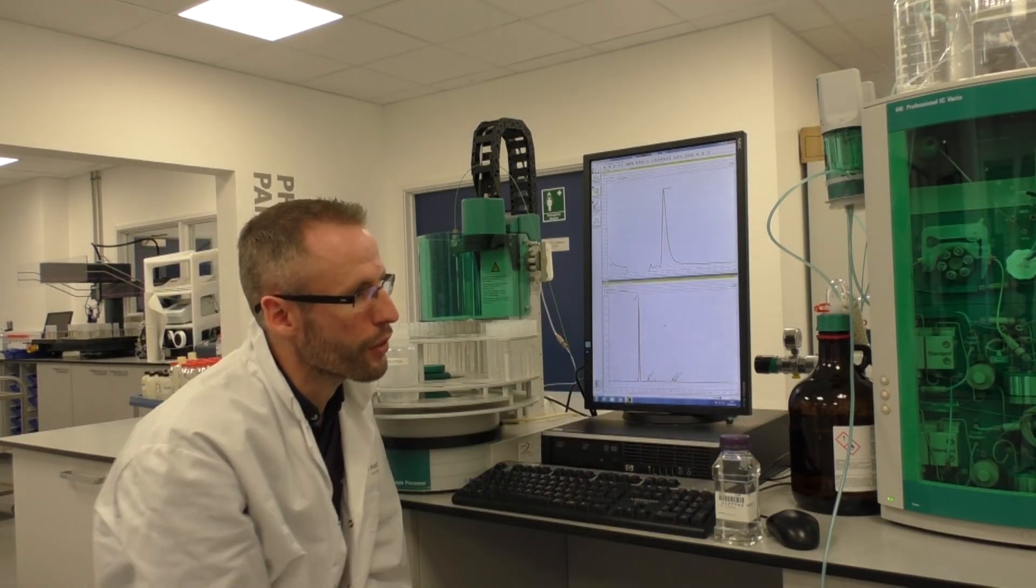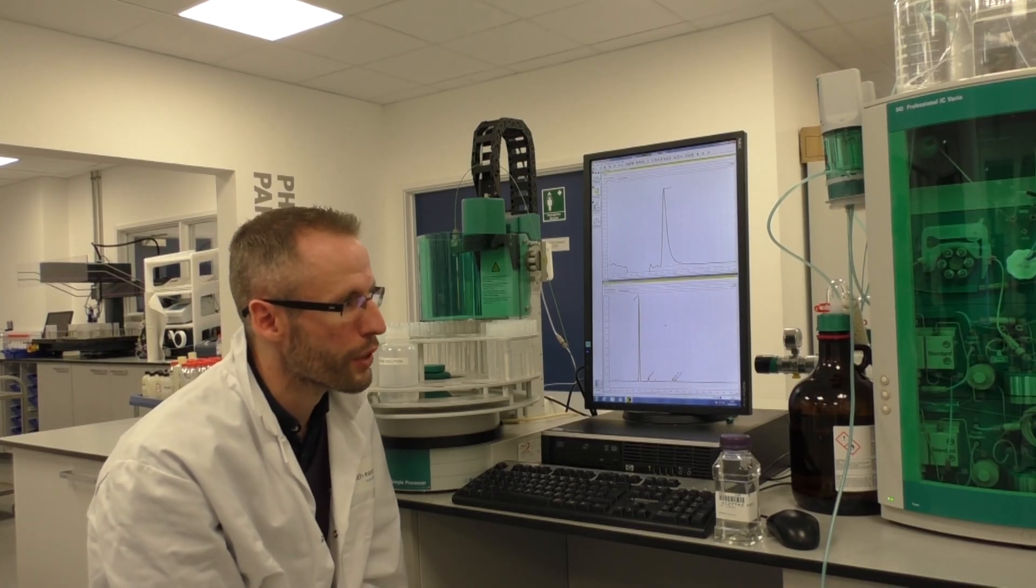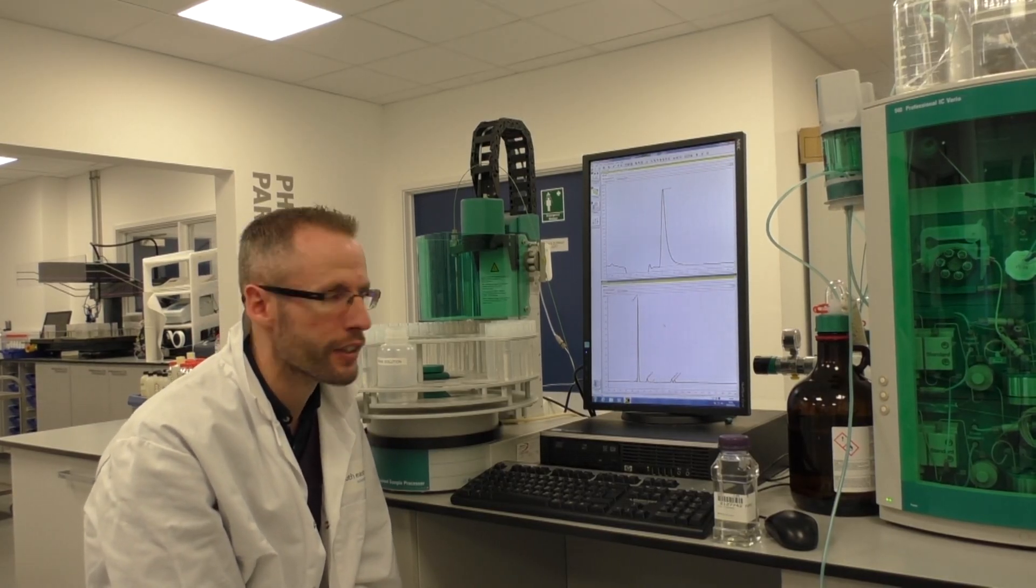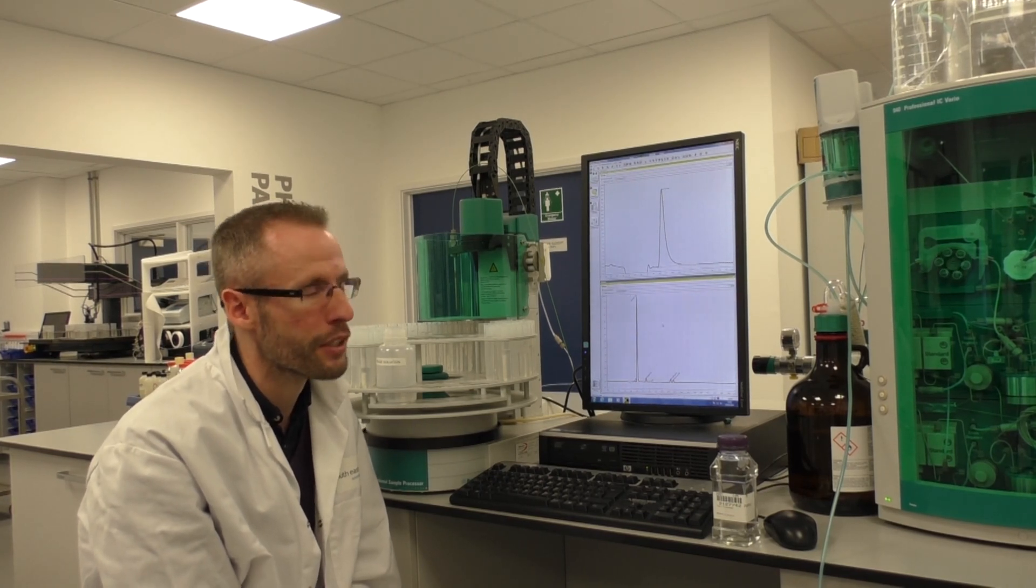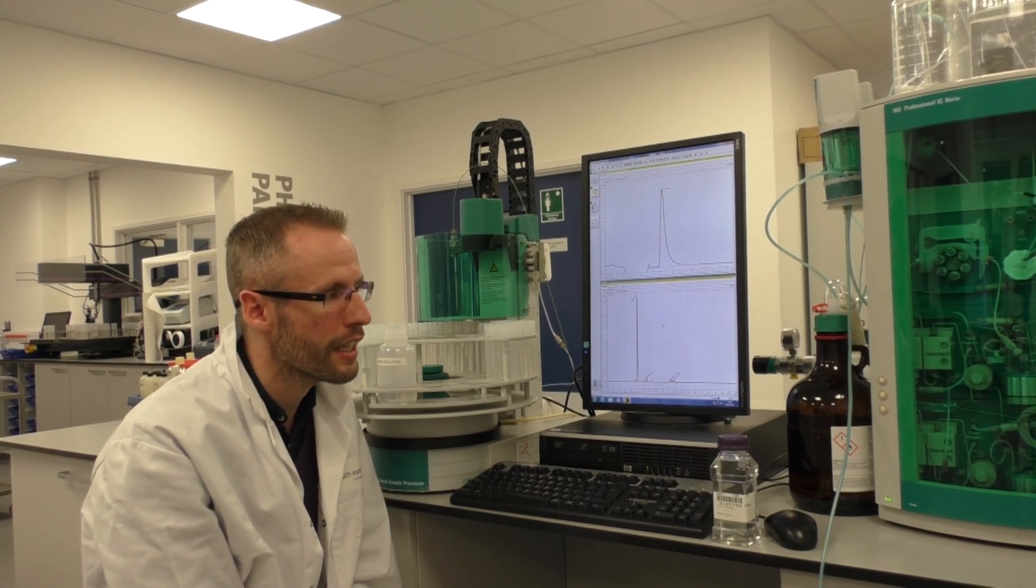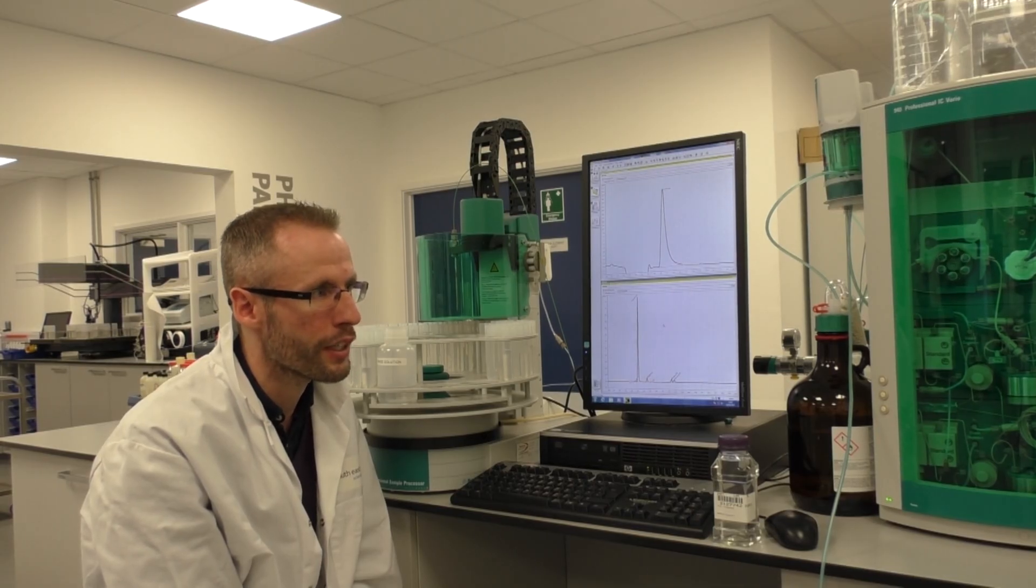The unit has two different pumps to it, so one running the oxyhalide method, one running the bromate method with the oxyhalides being measured by conductivity and the bromates by UV-Vis.